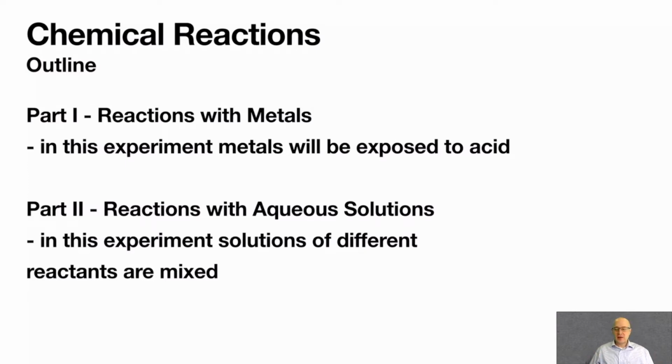Part 1, we'll be doing reactions with metals. I'll be doing that one for you as a video experiment. In Part 2, we'll do reactions with aqueous solutions. Again, I'll be doing that one for you. Don't worry, there's lots you can do at home. But these ones I'll do for you in the video because it can be slightly dangerous and slightly expensive.